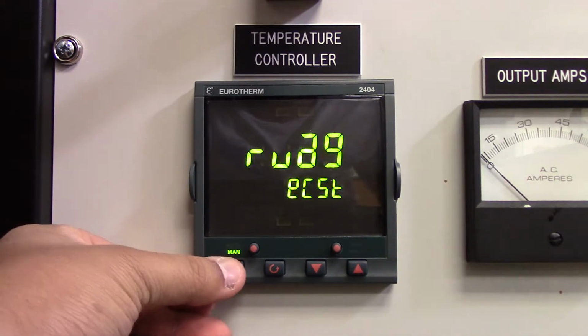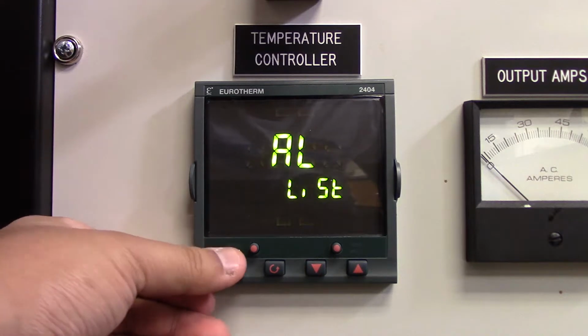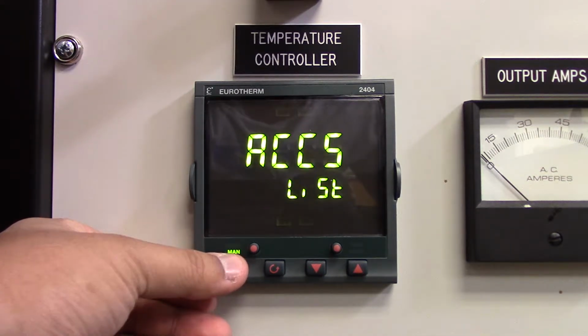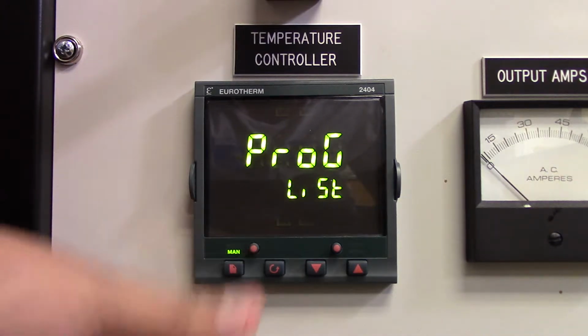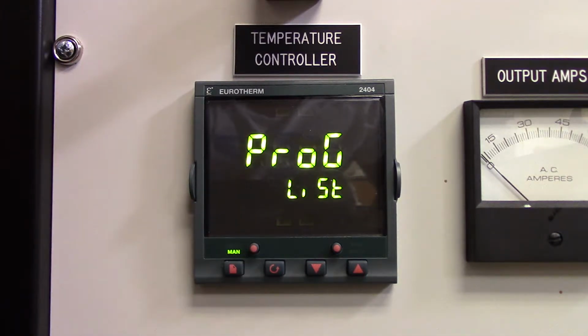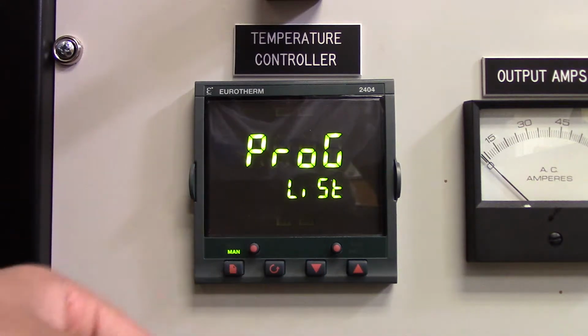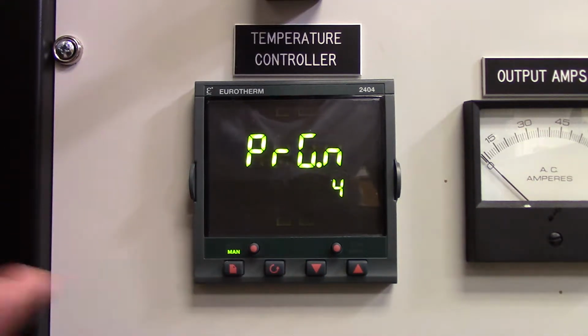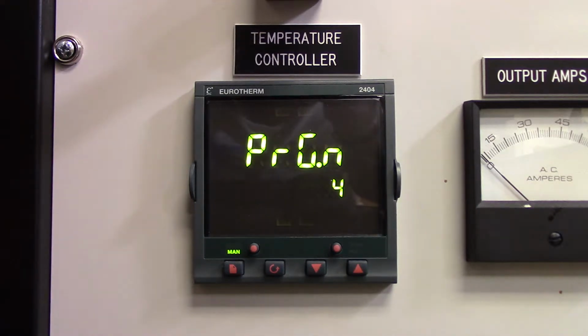So here's all the different menu options, but because we want to make a program, we're just going to scroll it to the program list tab. To confirm that we want to go into this menu, we're going to press this counterclockwise arrow. It's essentially the confirm button.